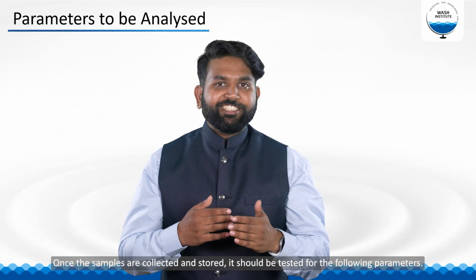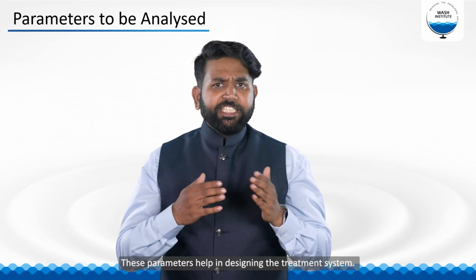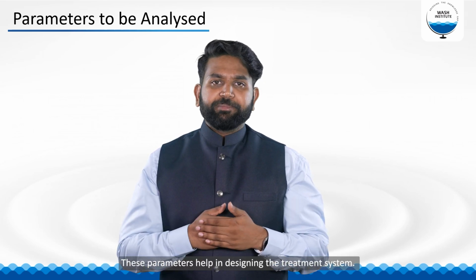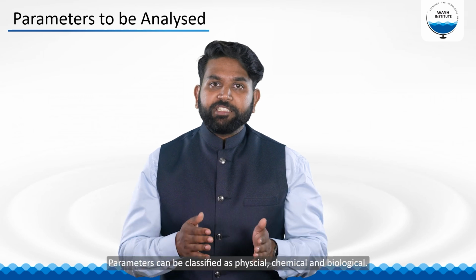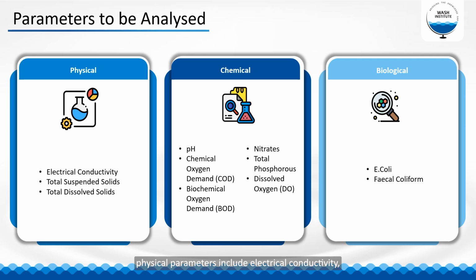Once the samples are collected and stored, they should be tested for the following parameters. These parameters help in designing the treatment system. Parameters can be classified as physical, chemical, and biological. Physical parameters include electrical conductivity, total suspended solids, and total dissolved solids, while chemical parameters include pH, chemical oxygen demand, biological oxygen demand, nitrates, total phosphorus, and dissolved oxygen. Biological parameters include E. coli and fecal coliform.